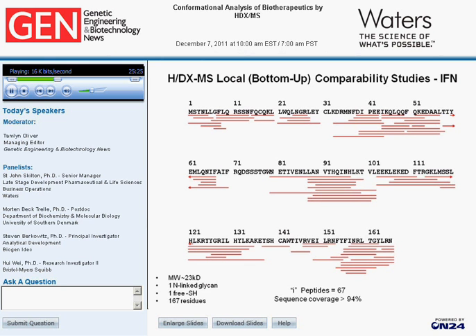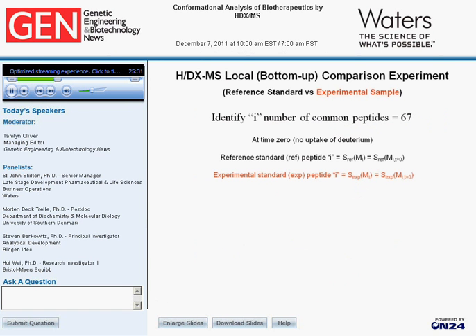So what we want to do, starting this experiment, is we have 67 peptides, and we start off at 0 time with the mass of these peptides known. We then basically incubate the protein in deuterium exchange for various periods of time. In this case, throughout this discussion, we are going to take 5 data points. Next slide.